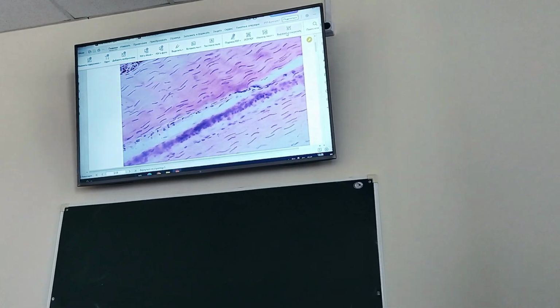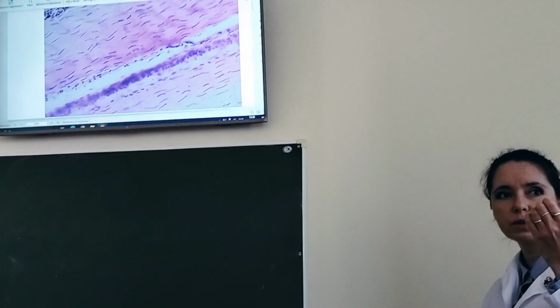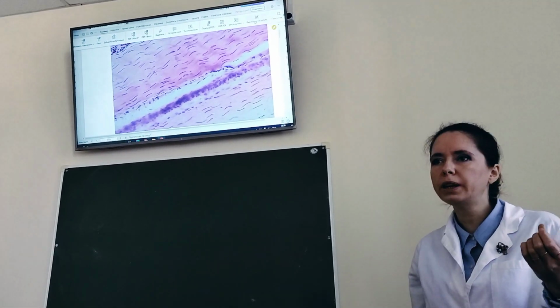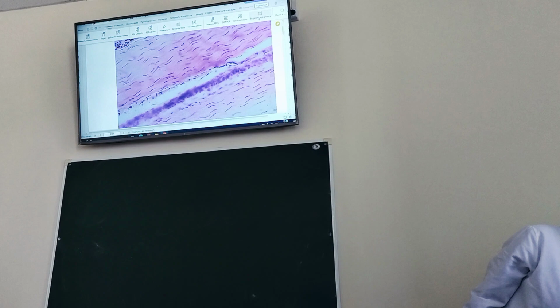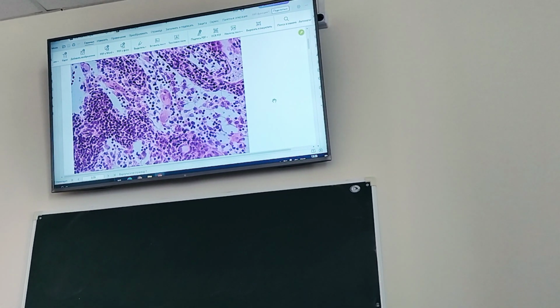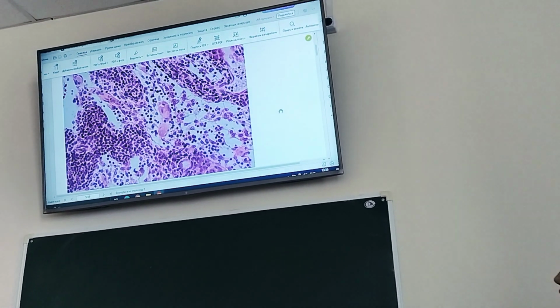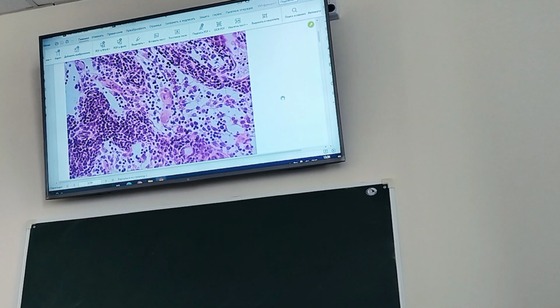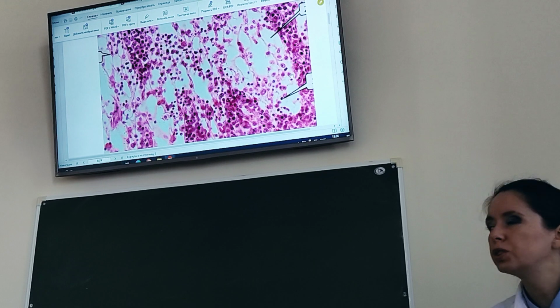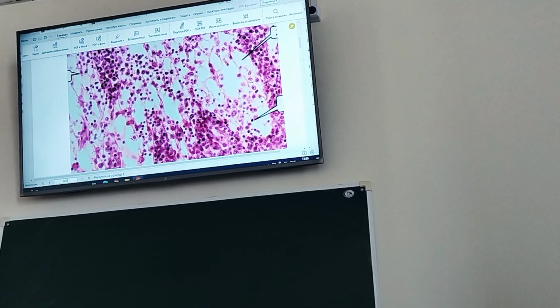That is all. You see, I take only the properties that are visible, with no details. We need no details for identification. Moving further. Another case, two slides you will see. This is a low magnification image, and the same in high magnification, two images. Let's try to identify this image.